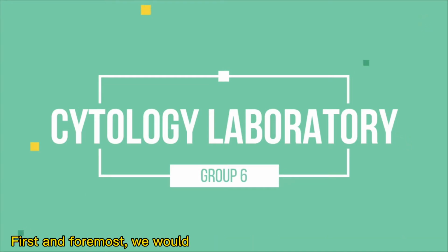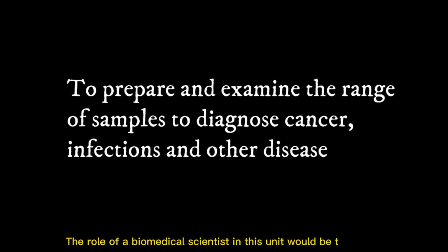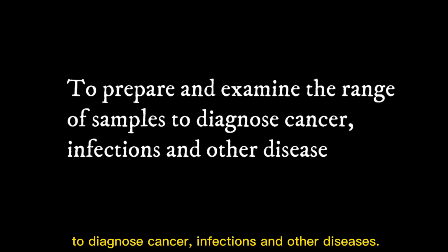First and foremost, we would like to explain the role of the biomedical scientist in the cytology lab before we head over to the laboratory tour. The role of a biomedical scientist in this unit will be to prepare and examine the range of samples to diagnose cancer, infections, and other diseases.